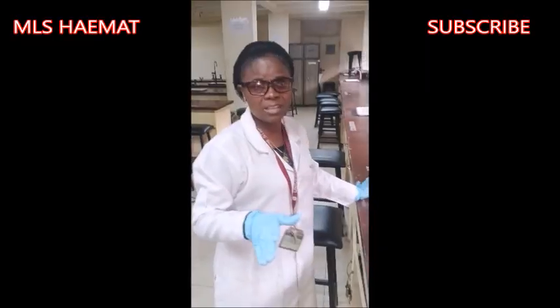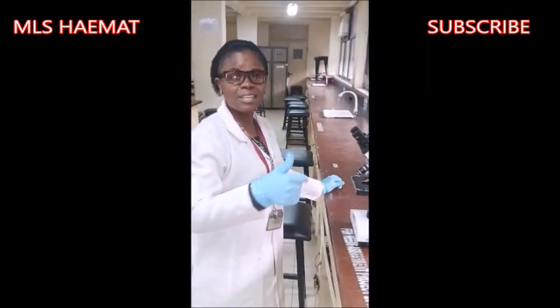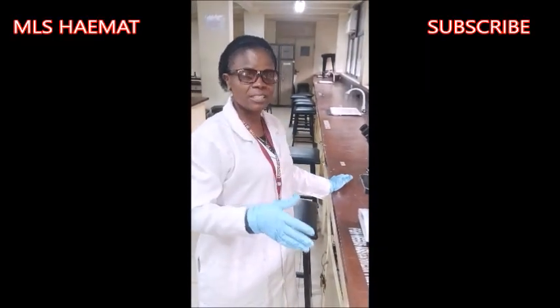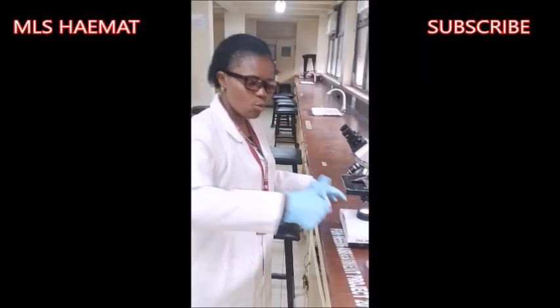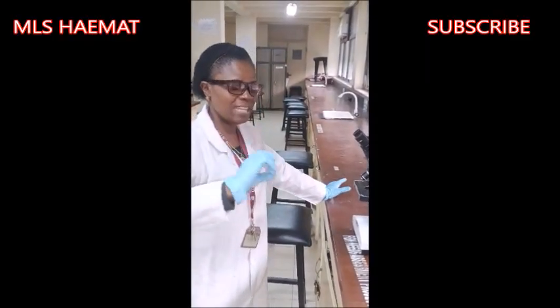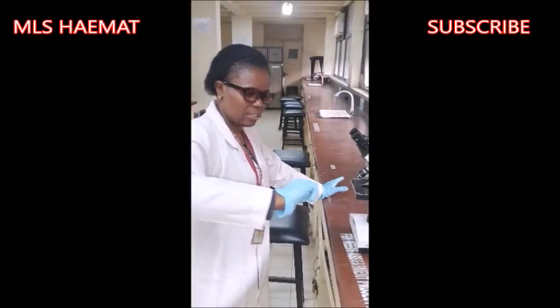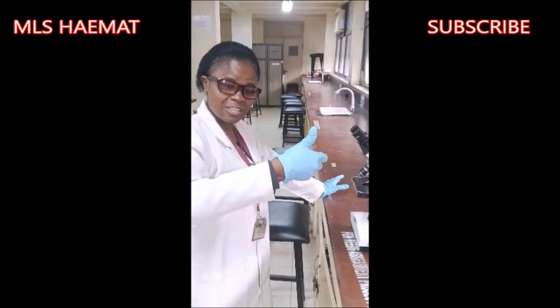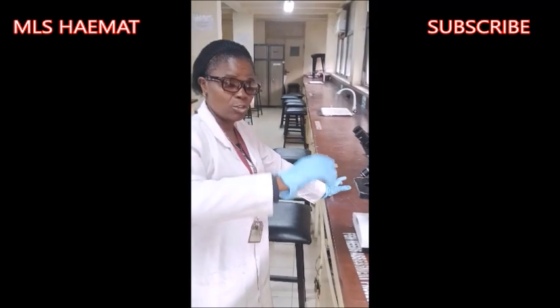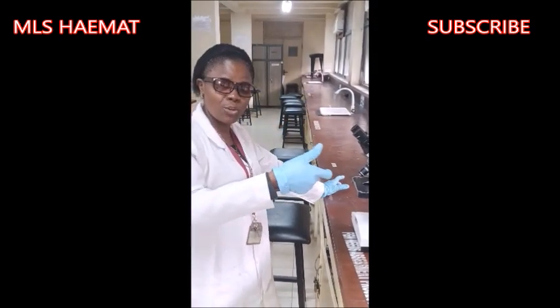You can say without much stress. Why? Because I started with that scanning objective lens. Just turn it to the ×10 objective lens, and then just have it at the back of your mind that you are moving forward. As in the coarse adjustment, you moved forward to raise the mechanical stage up for you to get the focus with the ×4 objective.